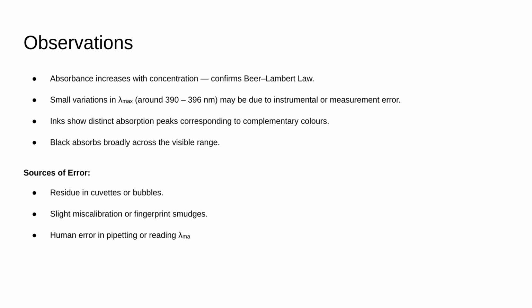Observations here. Obviously, absorbance increases with concentration, which confirms the Beer-Lambert law. There was a small variation around 390 to 396 nanometers, which may be due to instrumental or measurement errors. The ink showed distinct absorption peaks corresponding to complementary colors.